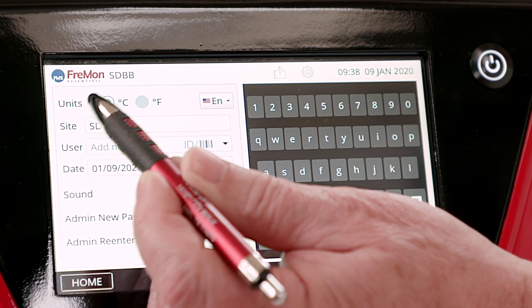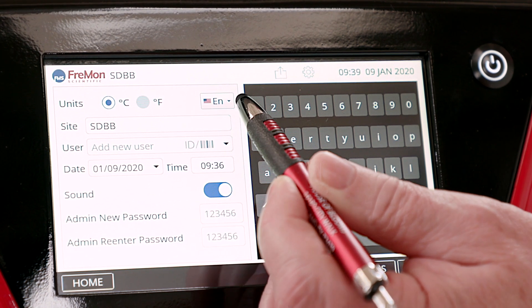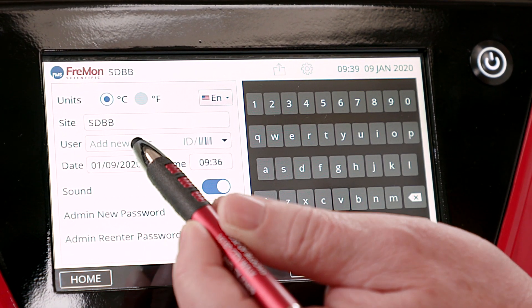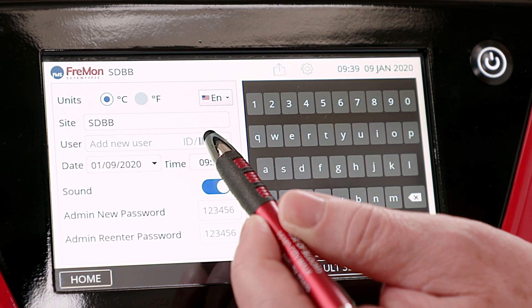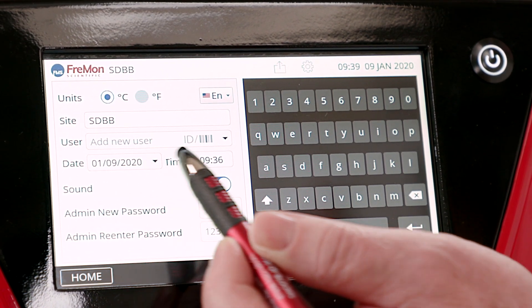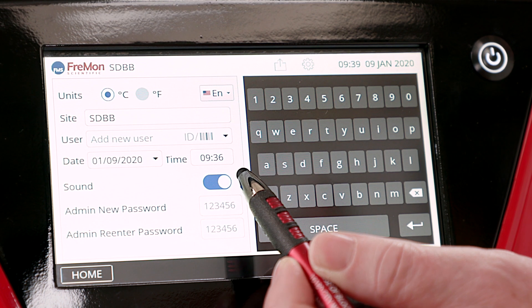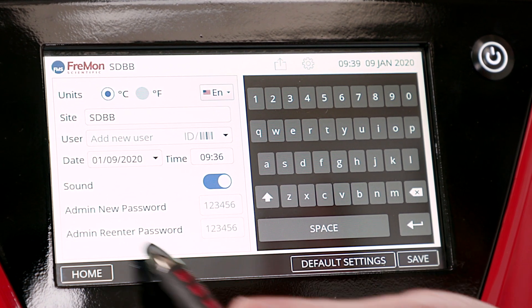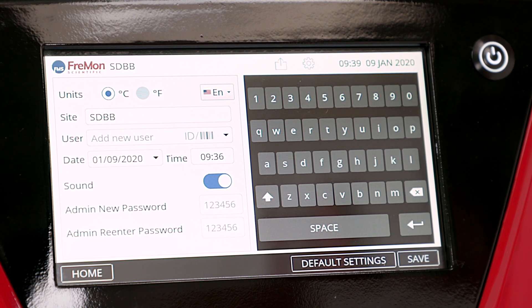You can adjust temperature units, language, site, user ID and barcode, date and time format, sound on or off, and the admin password can be changed.